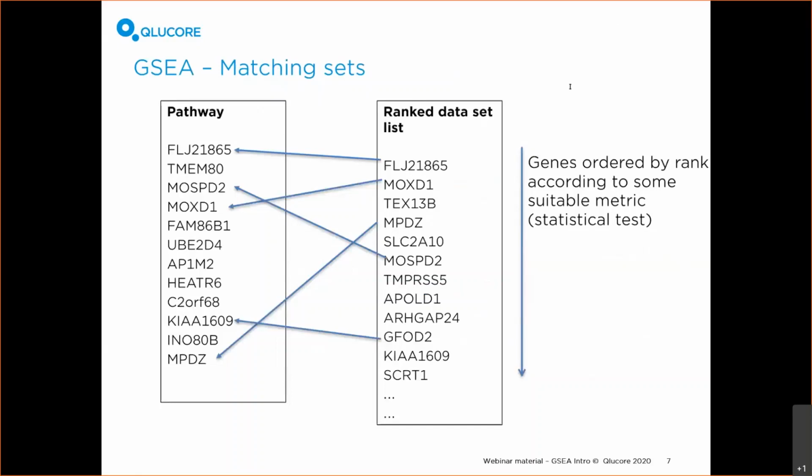So the question is, do you ignore the probes with the same gene symbol? No, I don't ignore them, but as I showed in the demo, I create, for instance, an average. I calculate the average for the 2 or 3 probes with the same gene, or I take the maximum value or the minimum value.